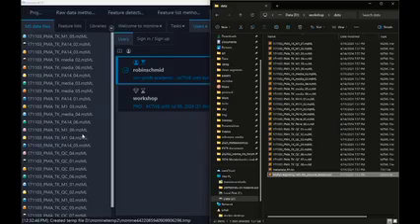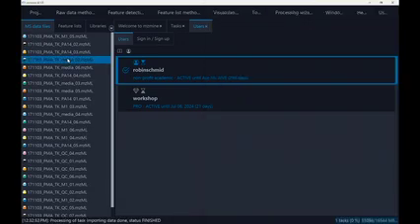Those are some microbial extracts, so LC-MS/MS data acquired with data-dependent acquisition on an Orbitrap instrument. But this is also very much applicable to any other setup.